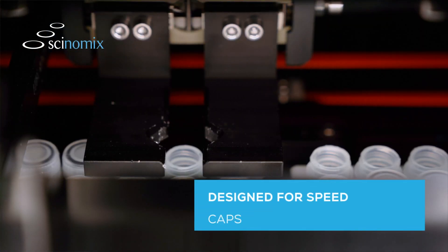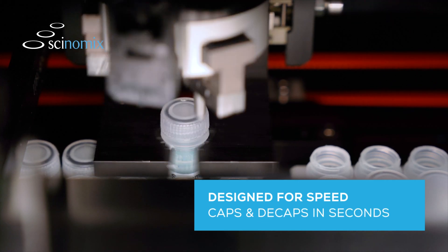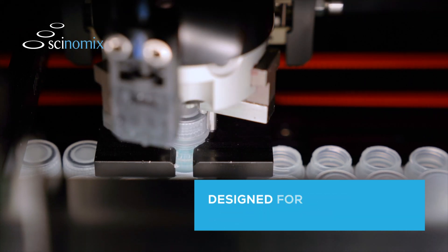With the ability to cap and decap in mere seconds, RapidCap2 is a clear favorite for improving your lab's efficiency. No more frustration waiting for jobs to finish.